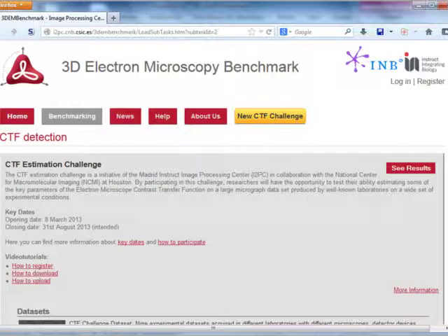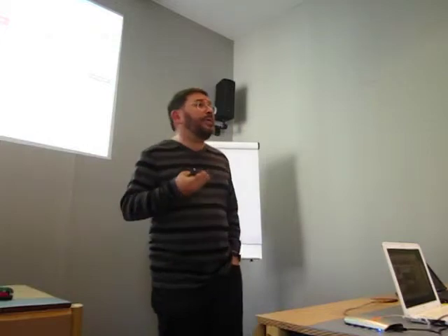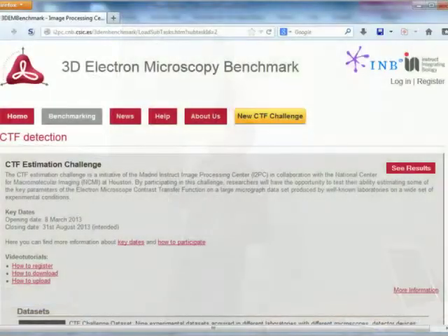Of course, we have many algorithms, and we need to sort these algorithms, and we are doing what we call benchmarks. That is actually a centralized ranking of how certain algorithms behave for certain data sets and things like that. What I'm showing you is where we are at this moment. We have already finished, in collaboration with Weiler, the benchmark on point spread function estimation. But in electron microscopy, I was telling you, we talk more in the Fourier space, so it is contrast transfer function estimation.